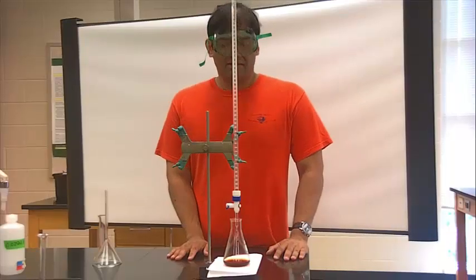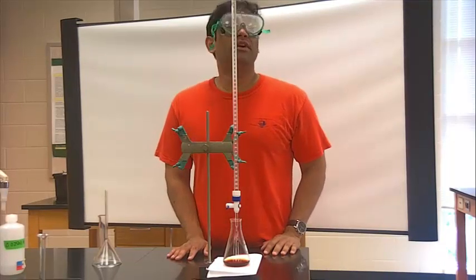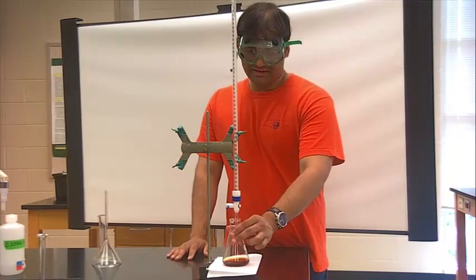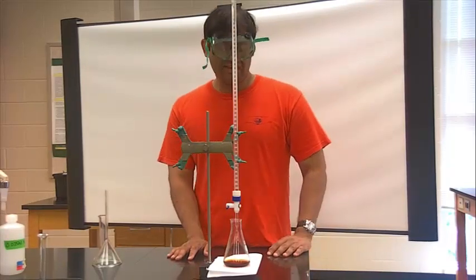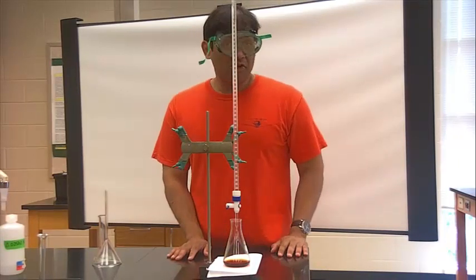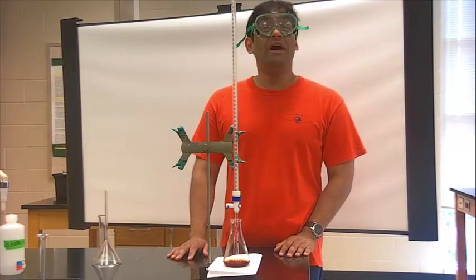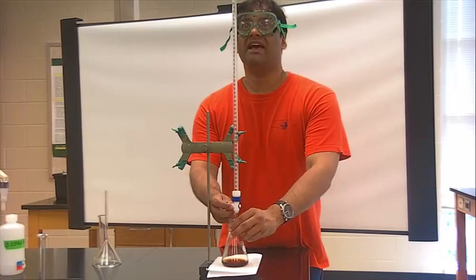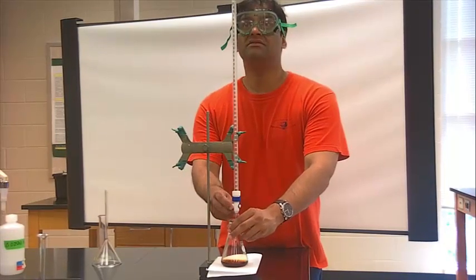All right, here we go. It's our trial titration. I have filled my burette up to 0.00 mils of my titrant, sodium thiosulfate. Here is my filtrate containing iodate ion and calcium ion. The iodate is going to react with this. And I have my starch to label the iodine. Let's go ahead and do 1 mil at a time in our trial titration. So I can be kind of fast and loose here initially. So that's 1 mil.